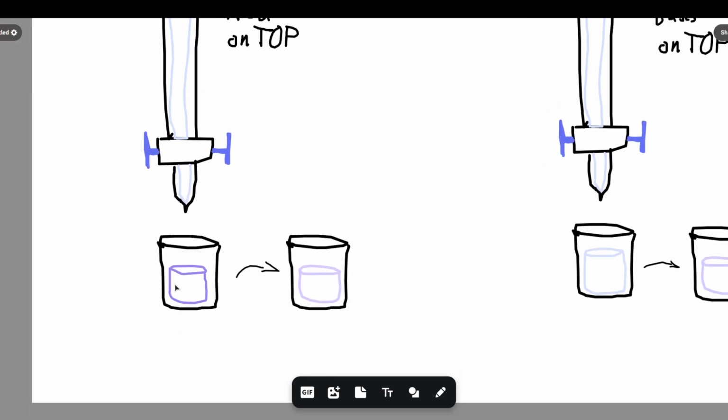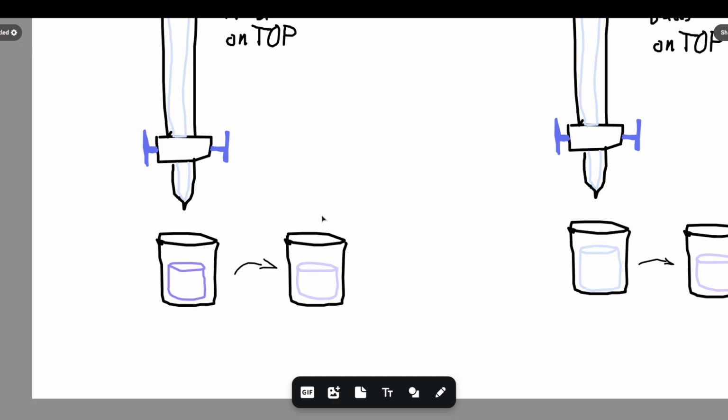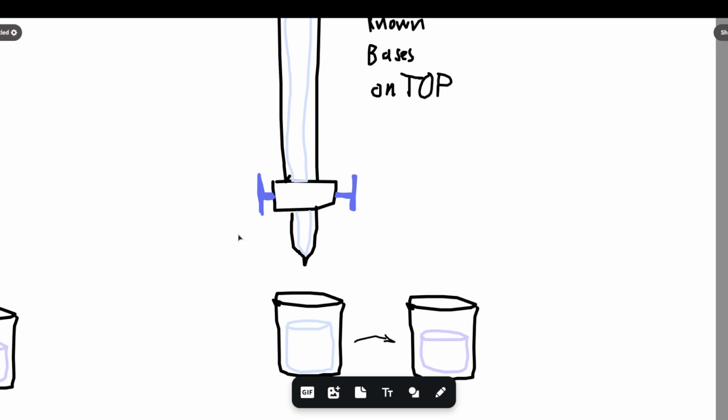When you first put in the phenolphthalein, it should immediately be purple because the bottom solution is basic. Ideally, you want to have the titration on a drip setting so that it slowly turns into a pinkish but somewhat clear solution.